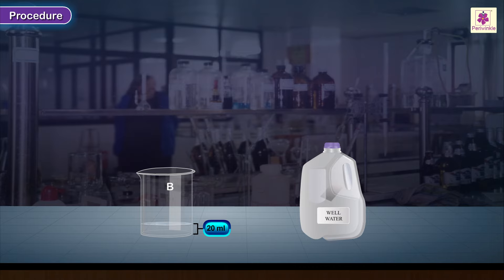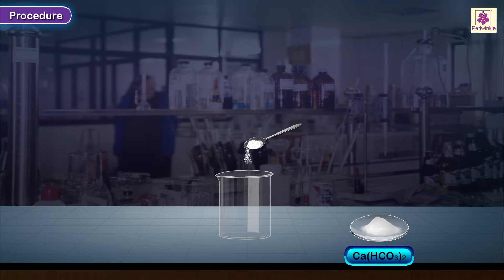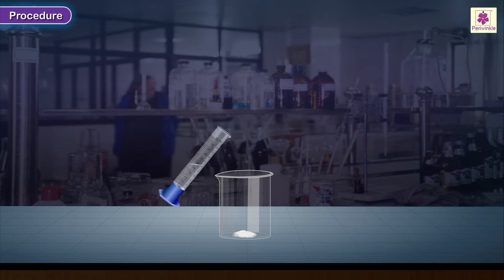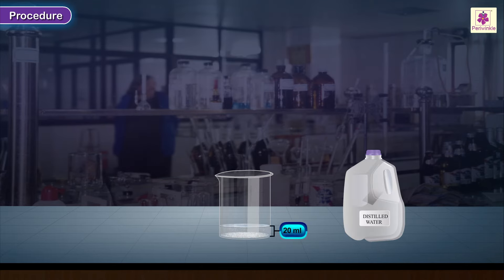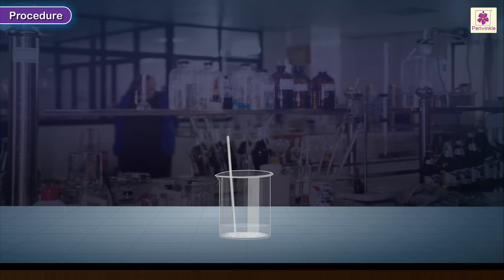Prepare a 10% calcium hydrogen carbonate solution as follows: Take 2 grams of calcium hydrogen carbonate in a beaker. Add 20 ml of distilled water to it. Stir till it dissolves. Label the beaker as C.